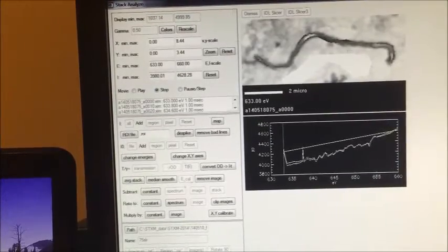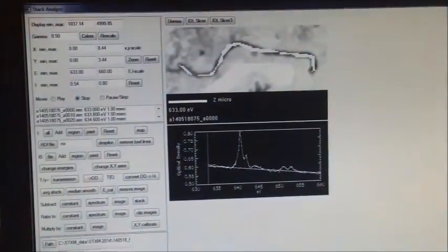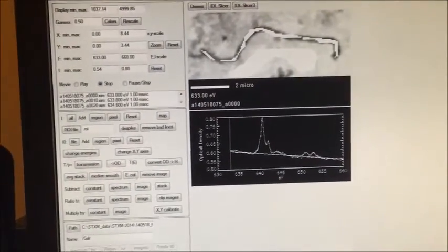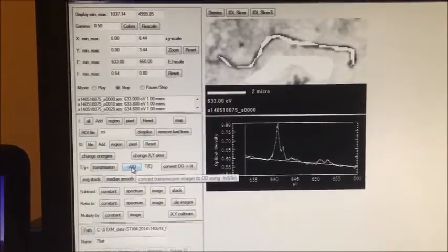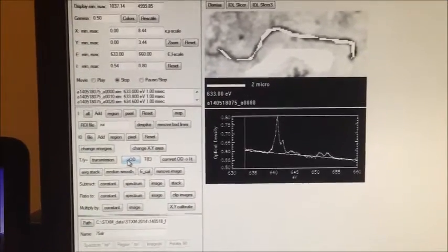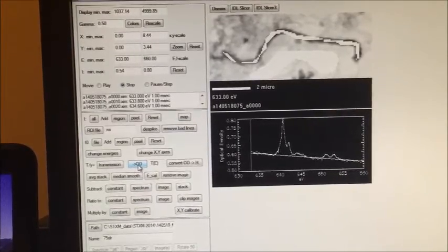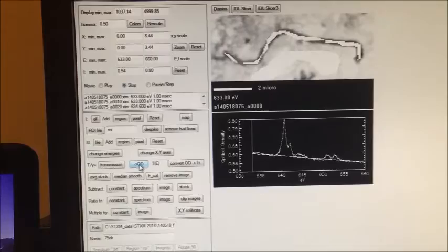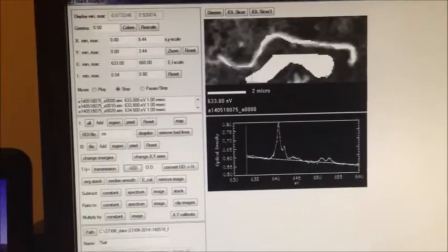So you are going to click on the nanowire to select the region. Okay, now right click. You can see this accept region and reject region in this small window is activated. So say accept region. Okay, now we have to get the optical density. You can see here the small tab which corresponds to the optical density, and you can see here the description below the cursor, convert transmission region to OD. So I'm going to click on that. You can see here I got the optical density.